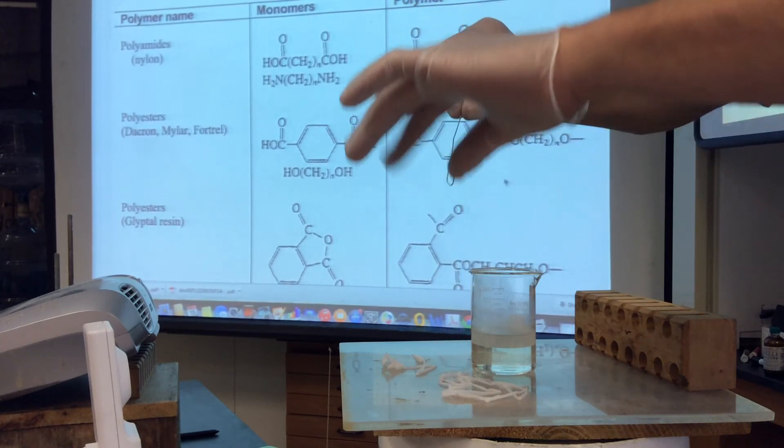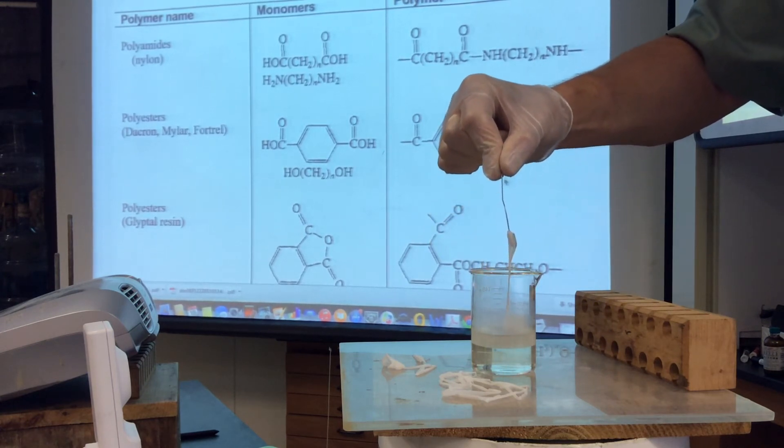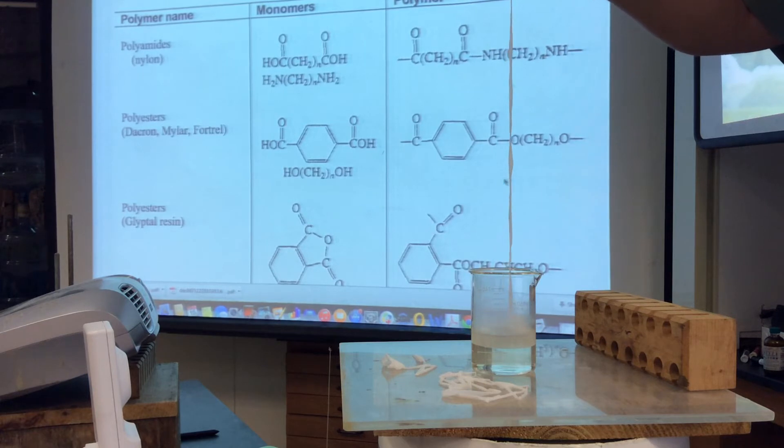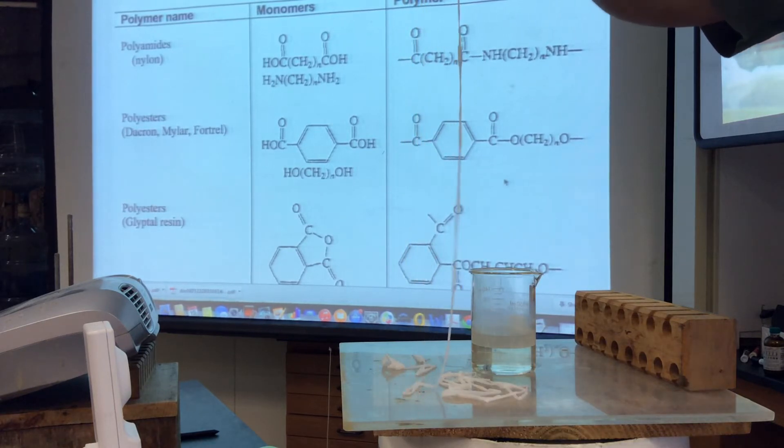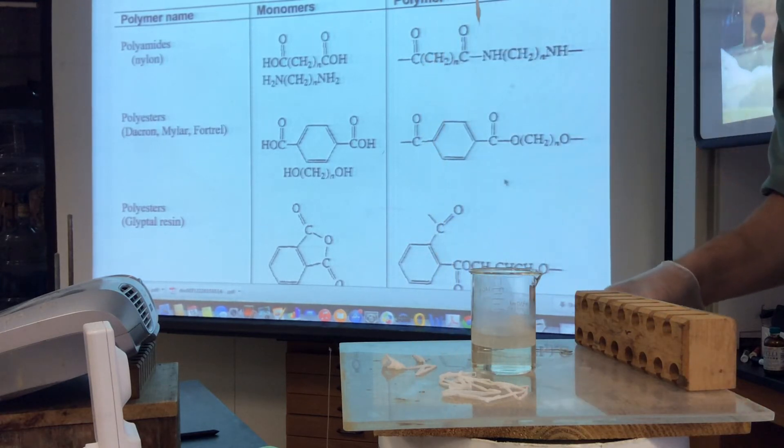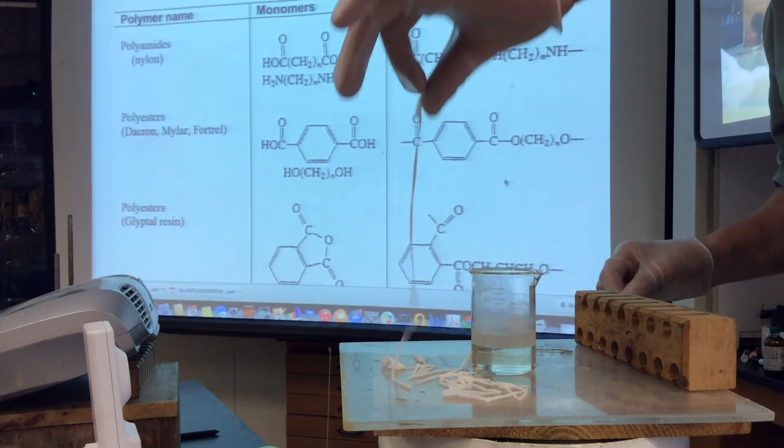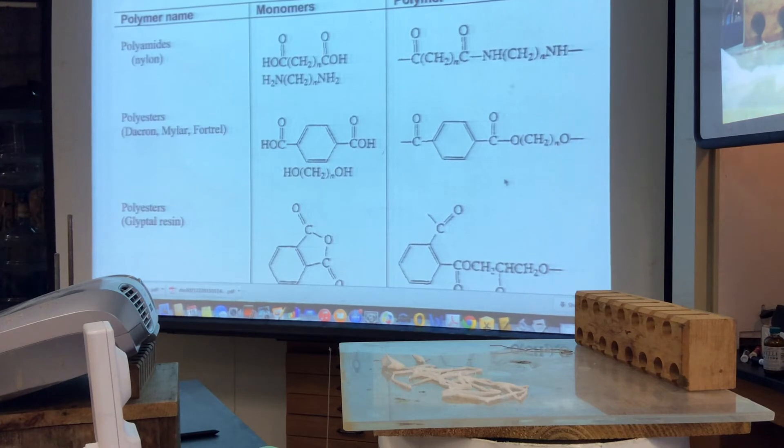But these are strands of nylon. Again, I'm just adding up monomers here. Water is coming out. You get the idea. And these are strands of nylon. So example of monomers lining themselves up in a way to create this directionality in the molecule that can give us that kind of length. So I'll put this back in the fume hood because the adipoyl chloride fumes, I don't want to keep breathing.